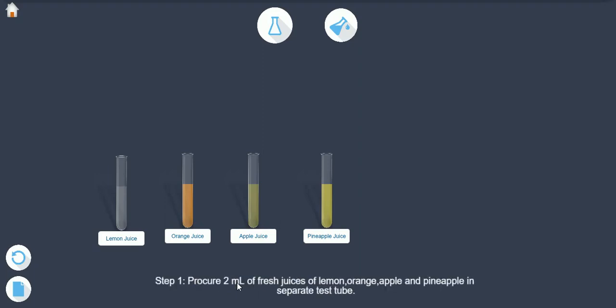Step 1: Procure 2 ml of fresh juices of lemon, orange, apple and pineapple in separate test tubes.